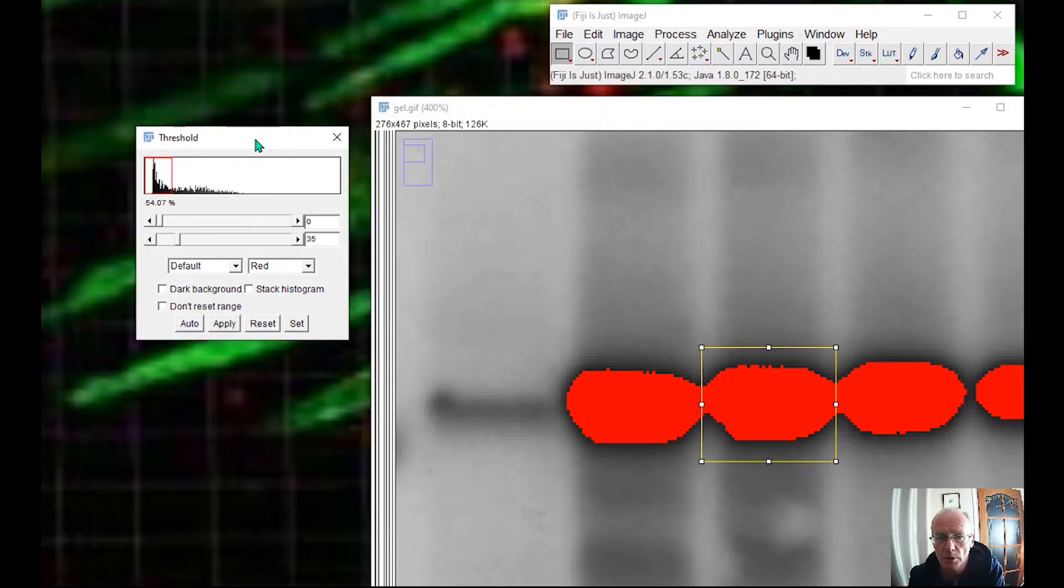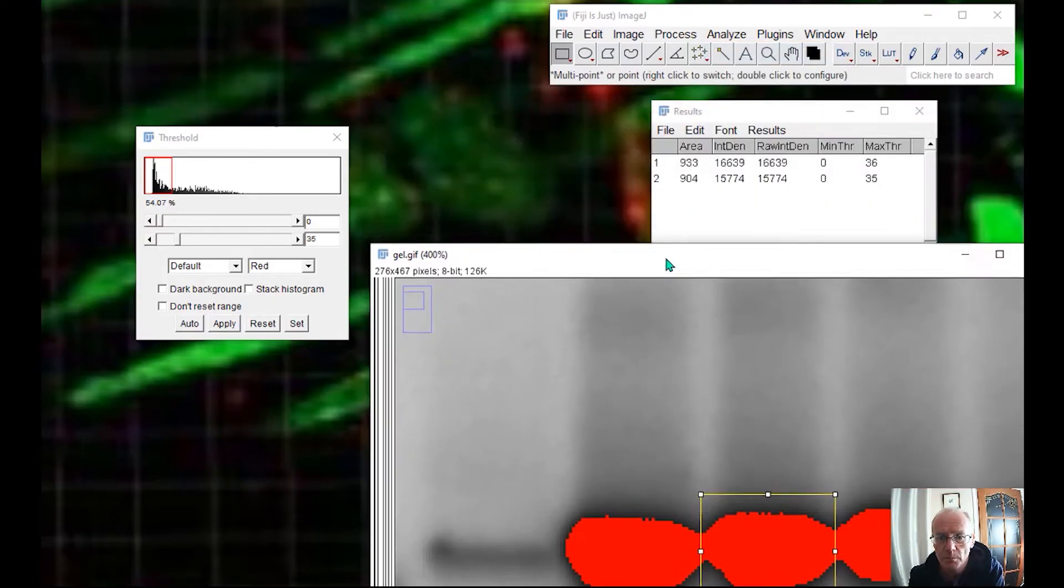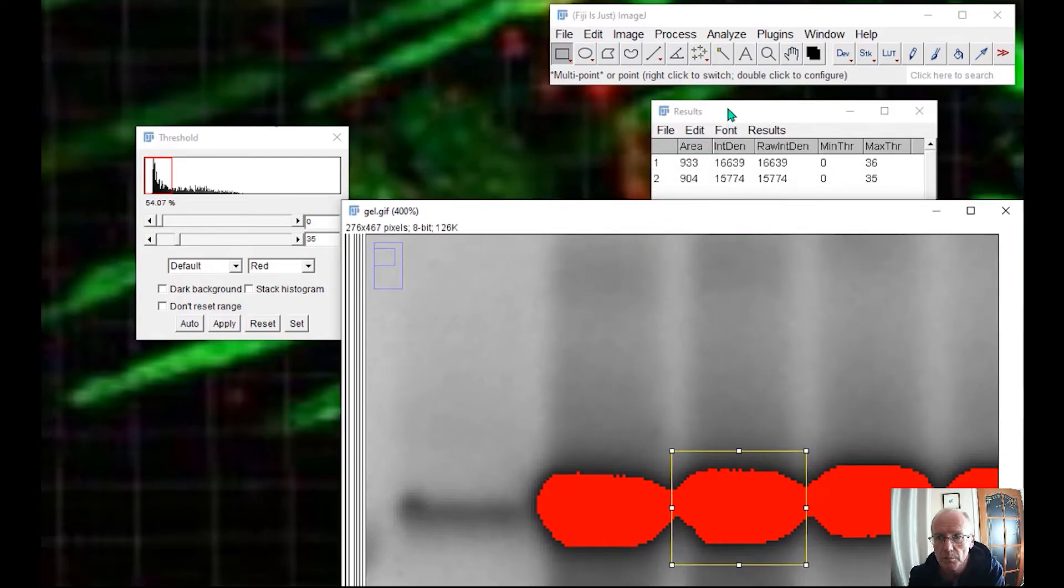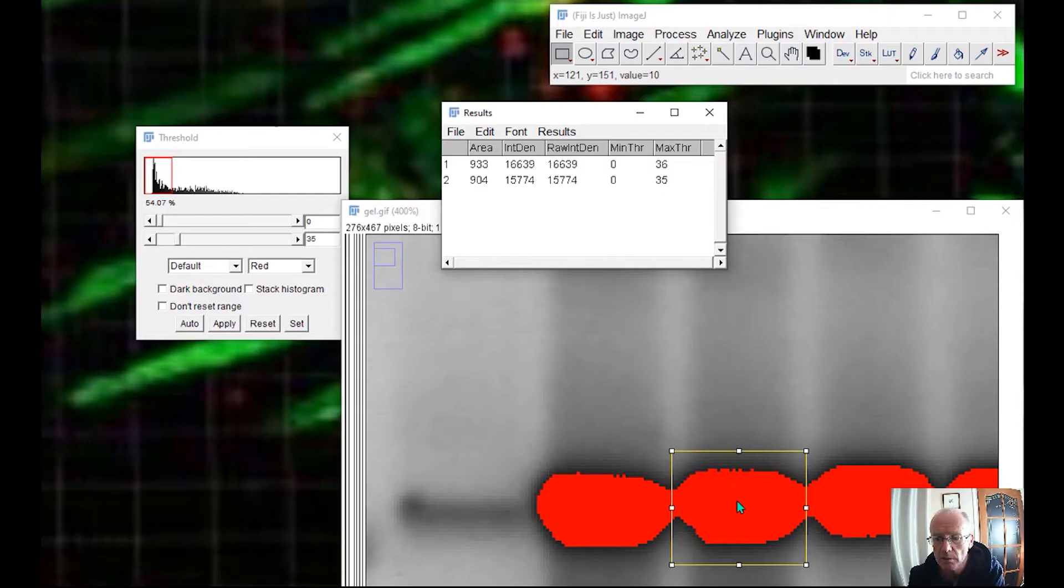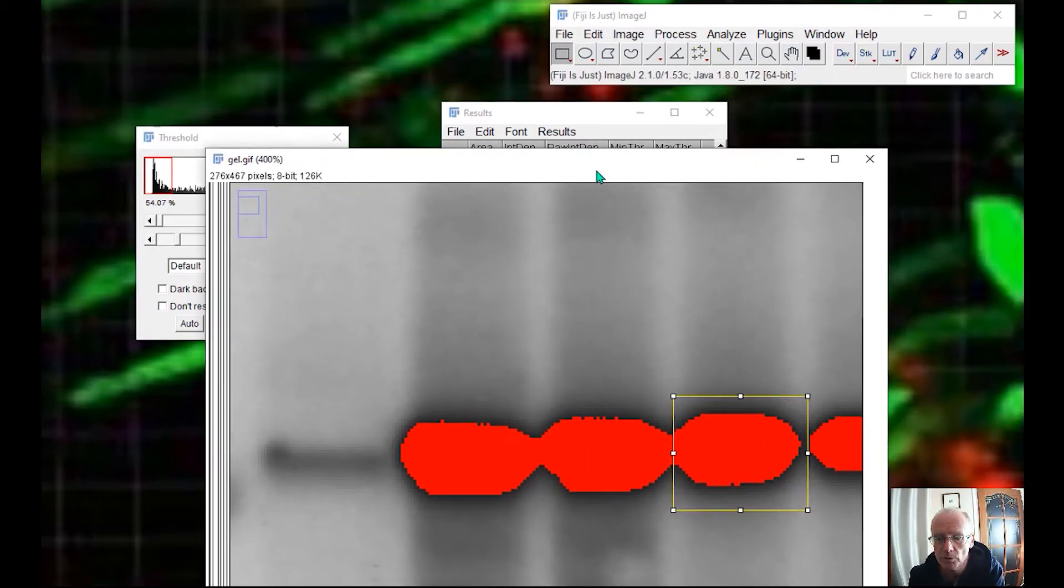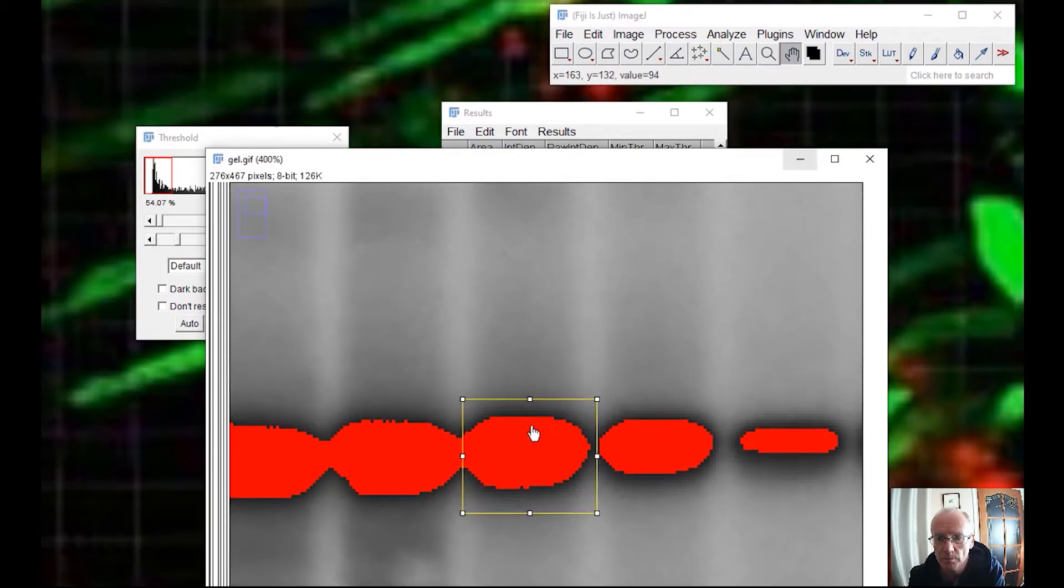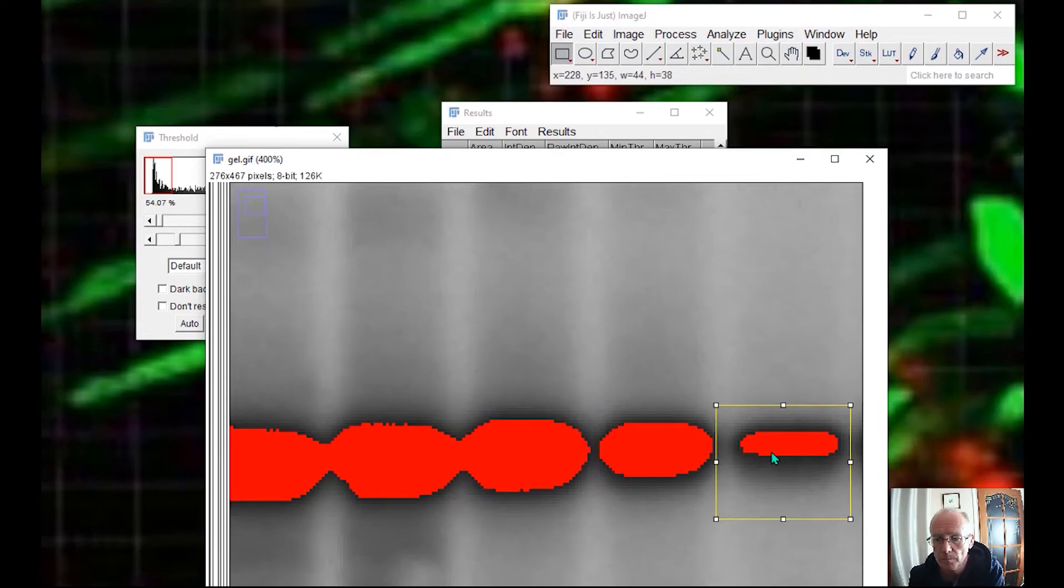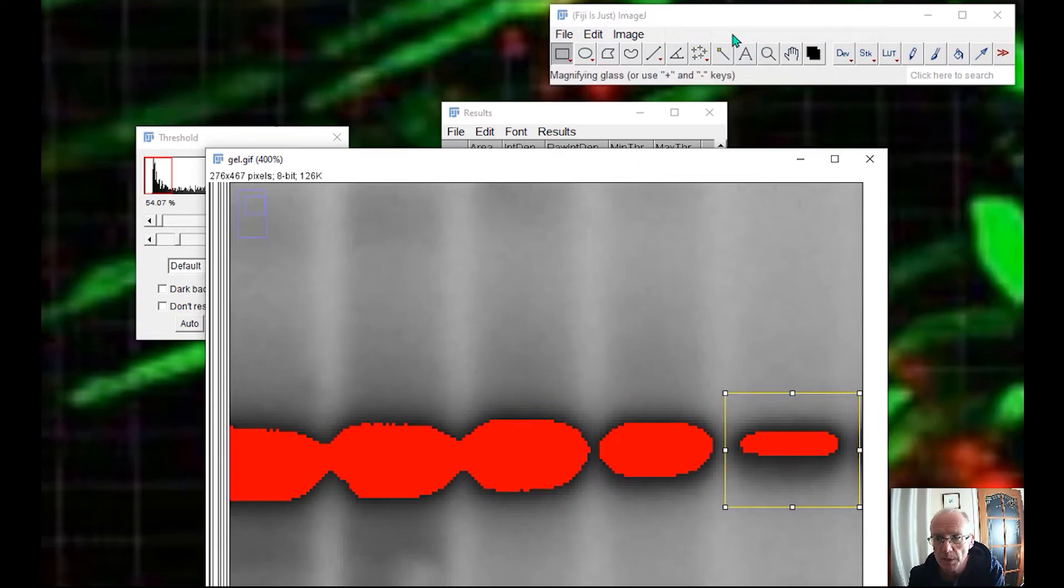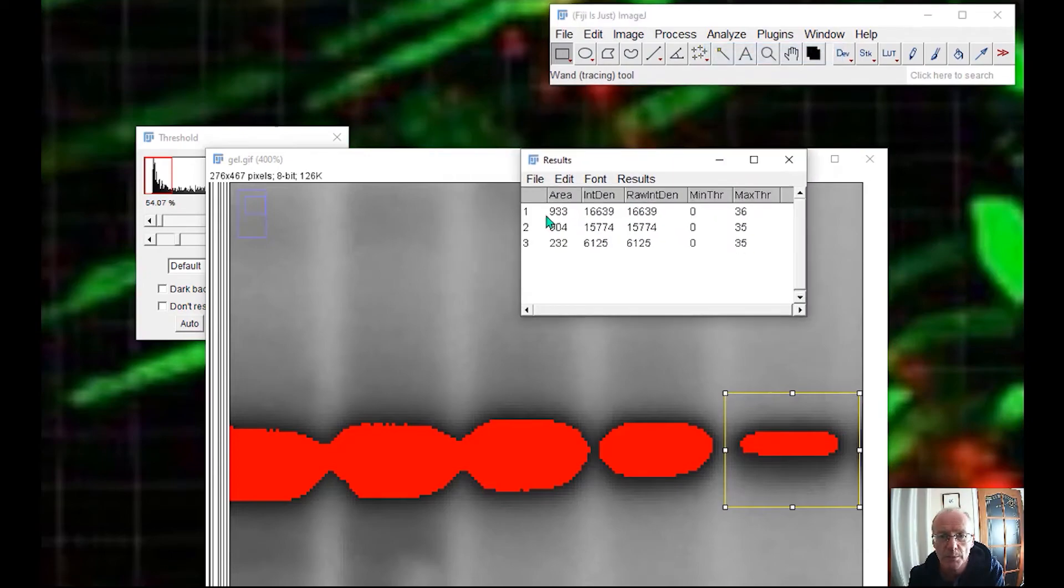Change the threshold. Now, maybe those of you who do these types of analysis wouldn't want to be changing the threshold all the time. I'm not too sure. Let's go to the next one. In fact, let's move further along and do the smaller one. Let's do a small one here and measure. So you see that it picks up the difference between the size of the blots.